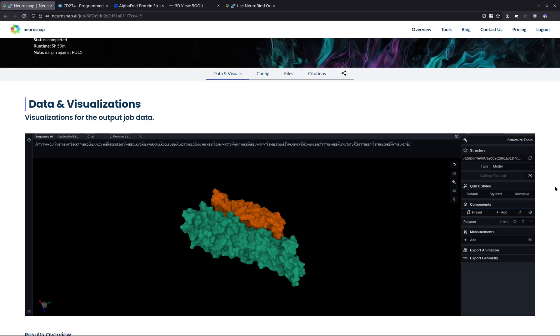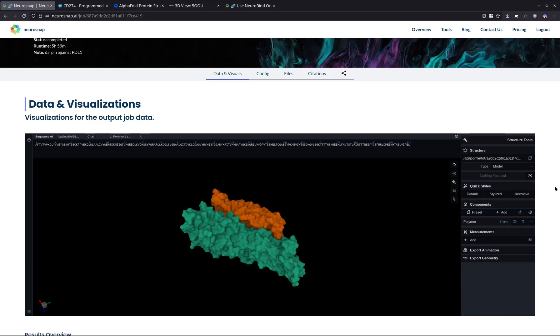NeuroSnap also offers a suite of complementary tools to validate and stress test your designs ahead of time. One approach that we suggest is running a molecular dynamics simulation using the GROMACS integration. It's a great way to assess the physical realism of your complex, and you can also refold the structure using Boltz 2 or AlphaFold 2 directly within NeuroSnap to double check any structural consistency. These extra steps can make a big difference in downstream success, which is why we really recommend at least doing one or two.